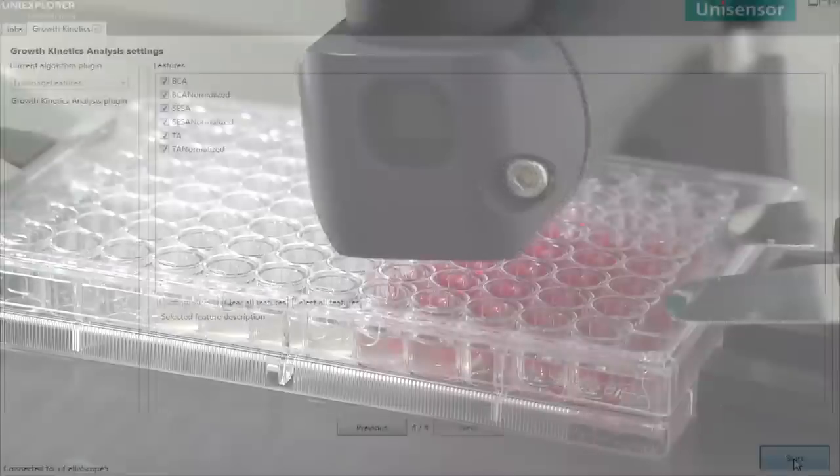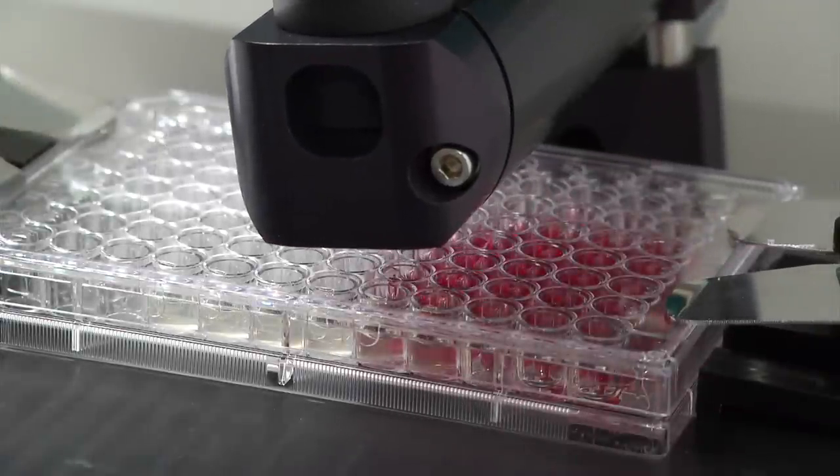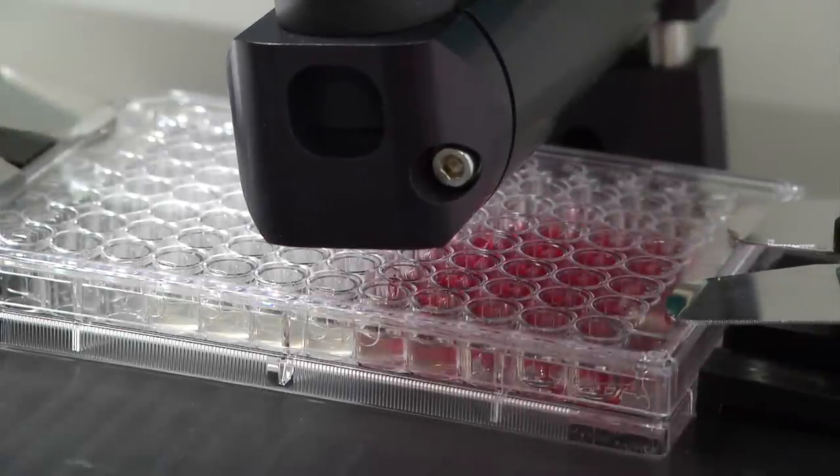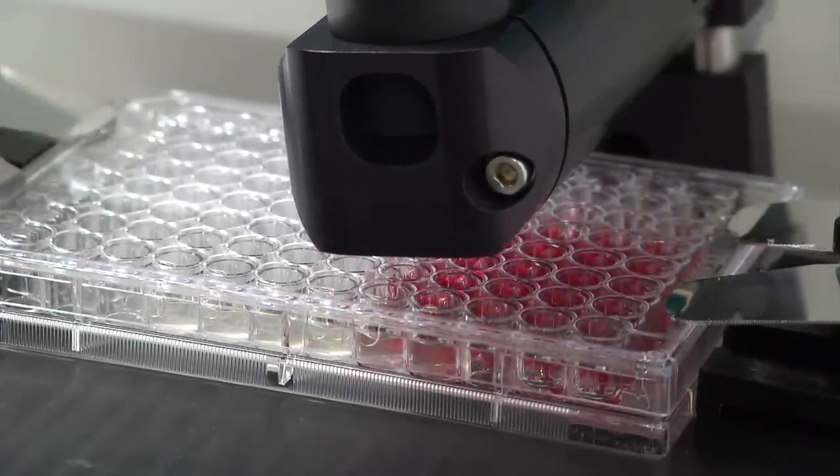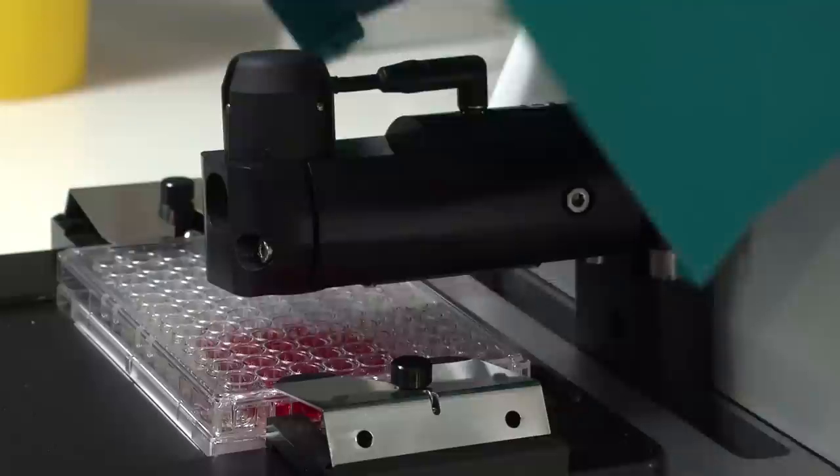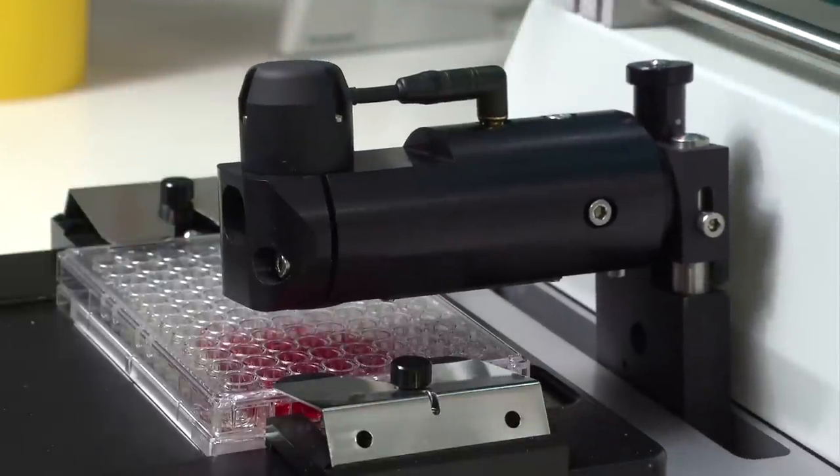Press Start and the Ocelloscope begins its scanning process based on the criteria that have been entered. The cover can be opened if you'd like to follow the scanning process.